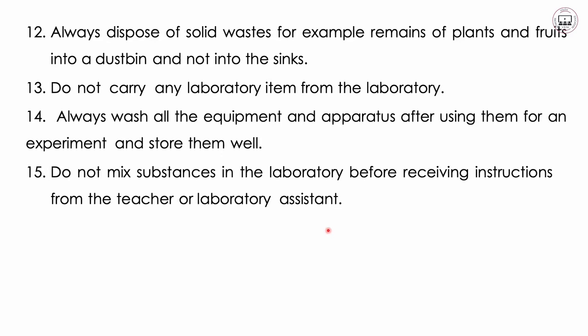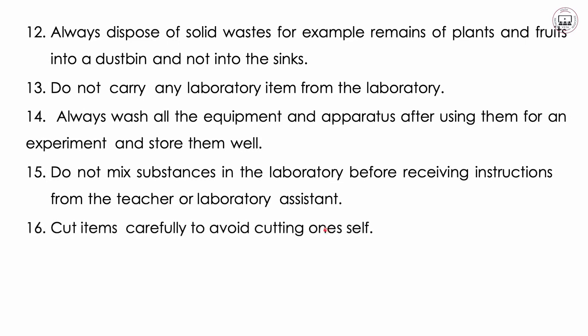So to avoid that, do not mix, because you are just learning them now. You don't know what kind of results they might bring after you mix them. So you should not mix any type of substance in the laboratory before you receive instructions from the teacher or any laboratory technician.